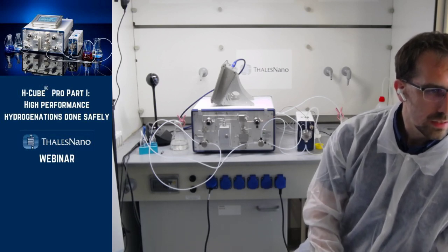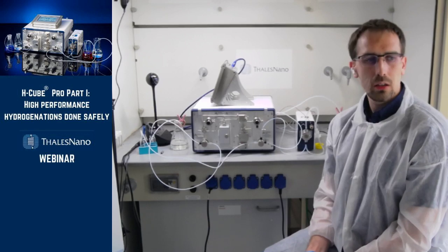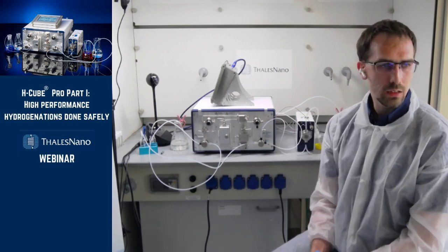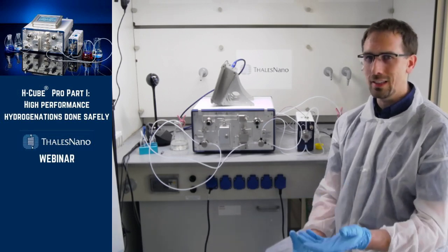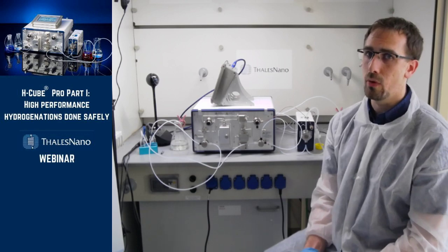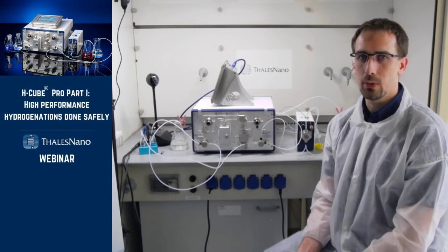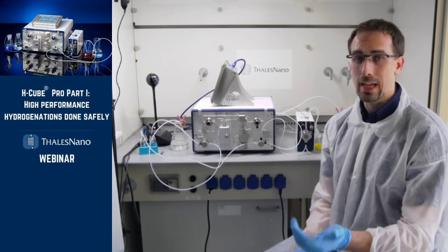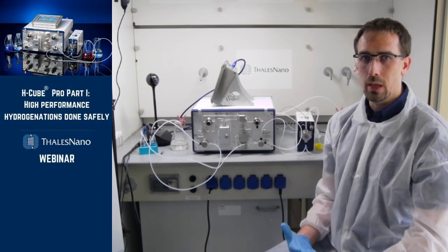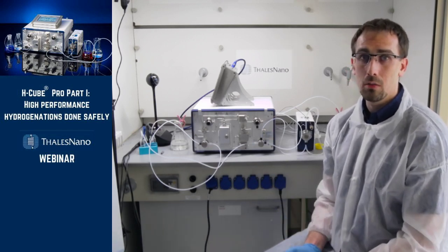Is there a means to control the integrity of the catalyst during a reaction, like a measurement of hydrogen consumption? We cannot measure the hydrogen consumption in the H-Cube Pro. In terms of the catalyst integrity, your catalyst lifetime, I guess that's the question, your catalyst lifetime will depend on the reaction which you are performing. So some materials would poison the catalyst, and let's say that you would be able to reduce just 50 milligrams of those, thiols maybe, or generally sulfur-containing compounds. But some materials can be reduced in big quantities on small cartridges. Sometimes you can even use a cartridge to produce grams of products.